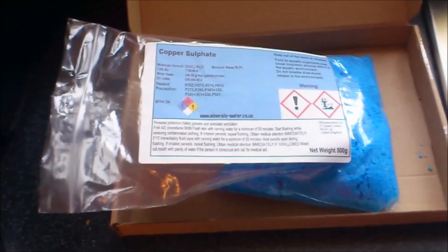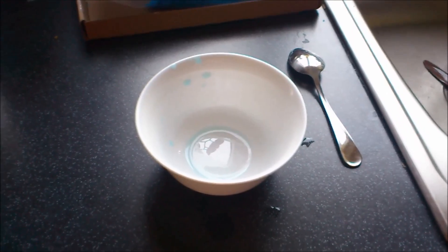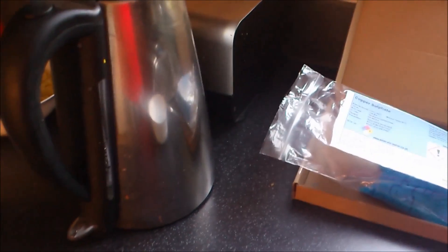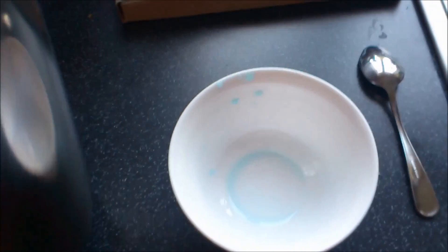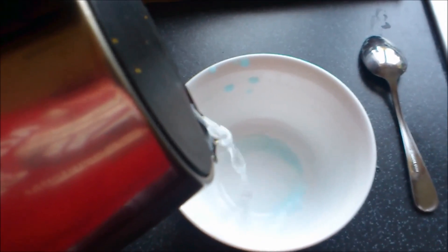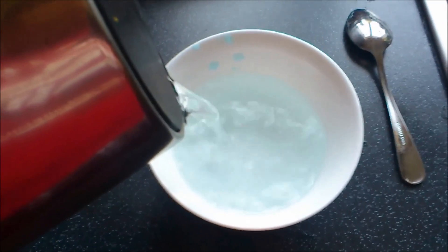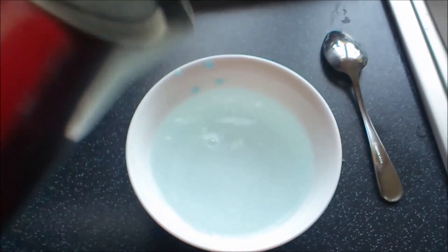This is our copper sulfate — it's a powder, as you can see. This is our container in which we are going to grow crystals. This is our hot boiled water and that's our teaspoon on the side. Firstly, put your boiled, still-hot water in the container and then add copper sulfate.